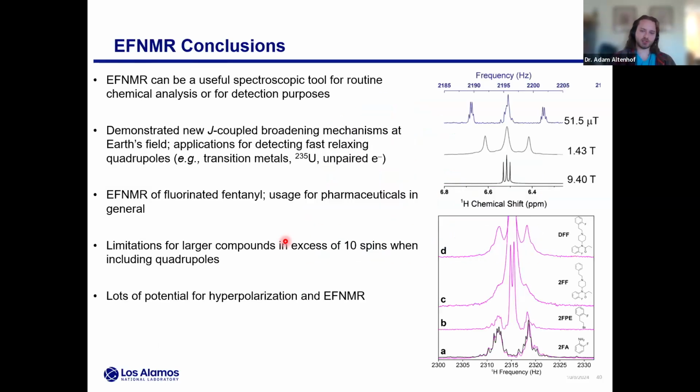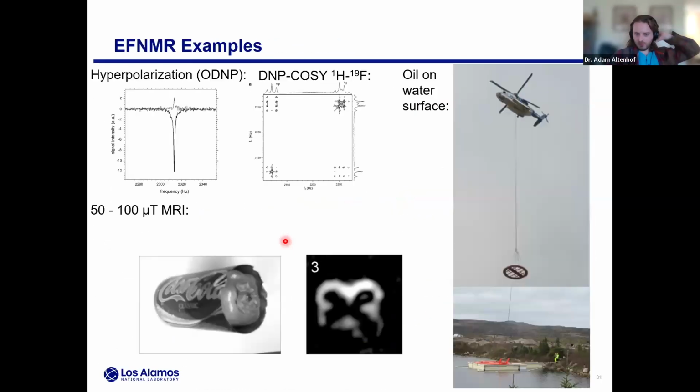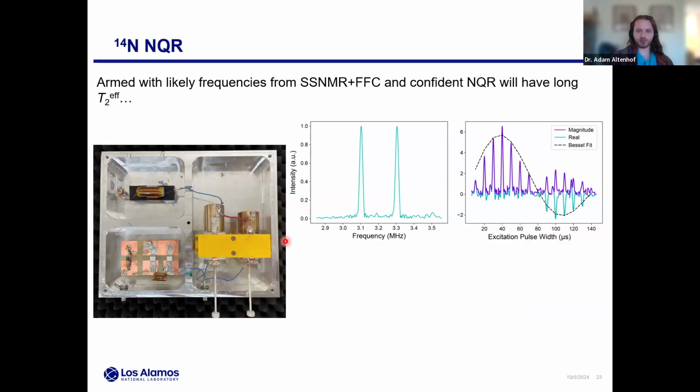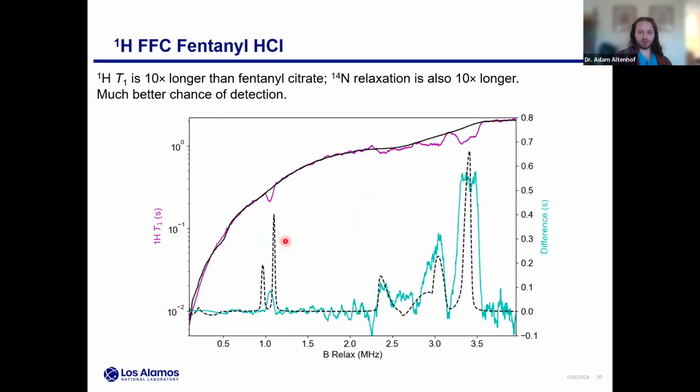So yeah, any one of these experiments, we're talking about usually on the order of weeks, honestly, probably to get something like this. Part of this is basically like a pseudo 3D experiment, right? You have the NMR detection, you have your relaxation delays, and then you have all that as a function of the relaxation field. And the signals are pretty dilute in general. So it is certainly very long.